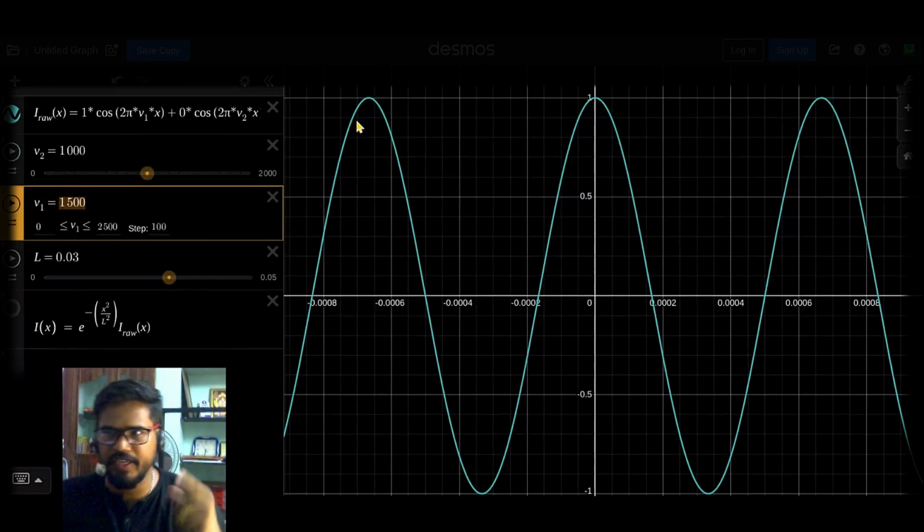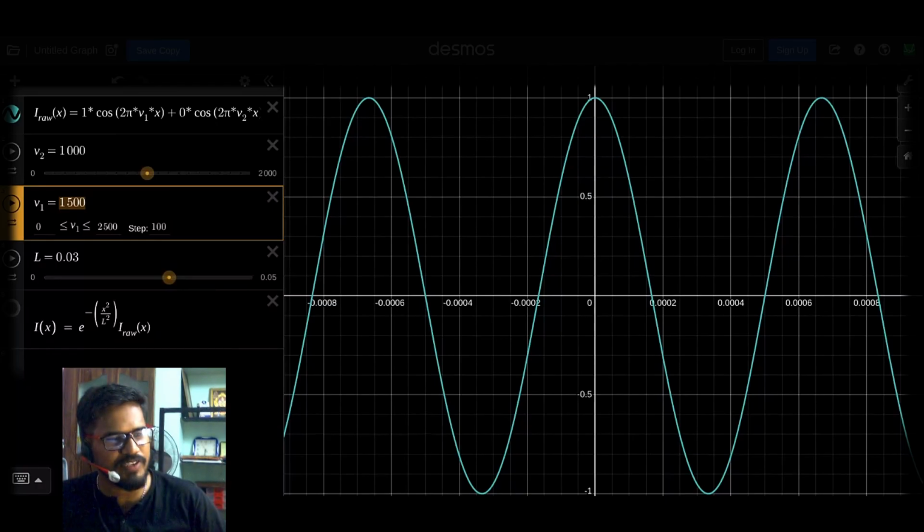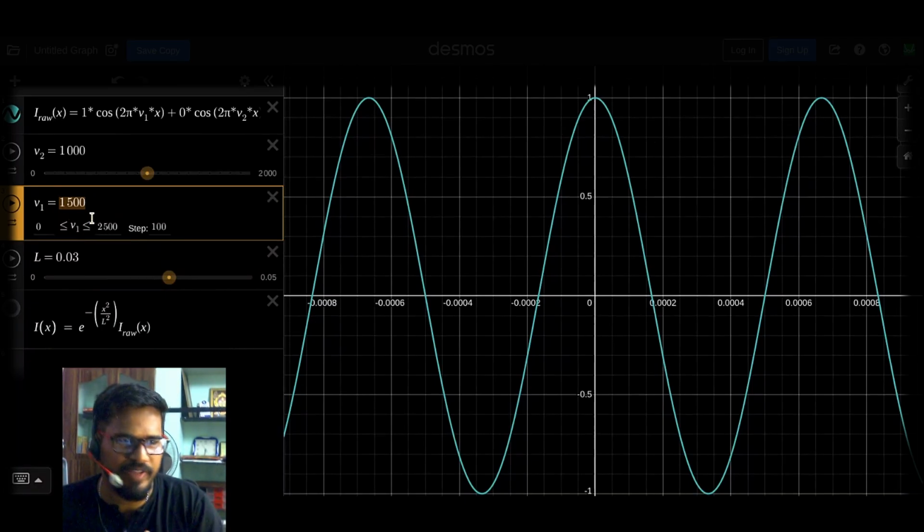Technically there is a slight path difference. Now things are constructively and destructively interfering. The path difference is also changing as a function of time. The motor is linearly translating the mirror. Path difference is a function of time. So initially this is constructive interference, destructive interference, constructive interference, destructive interference. So this thing oscillates. This is for a specific wavelength or wave number.